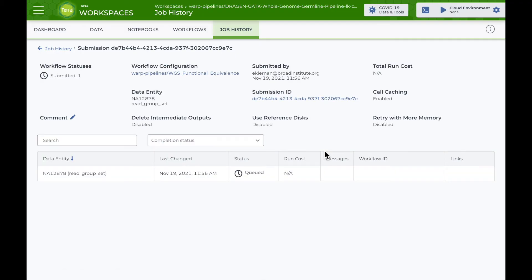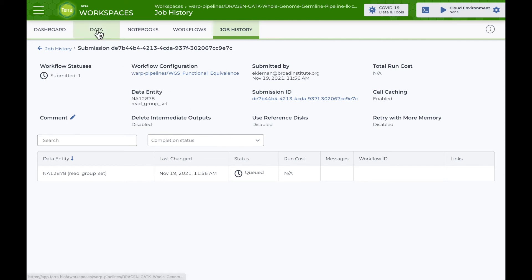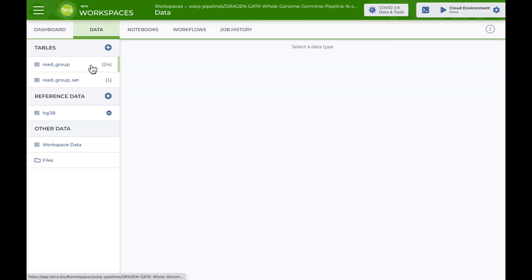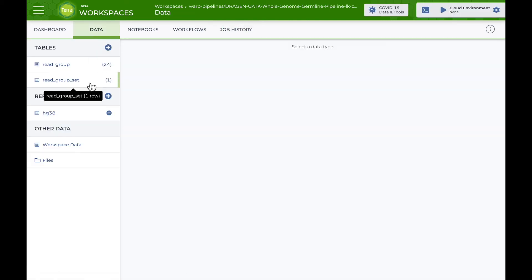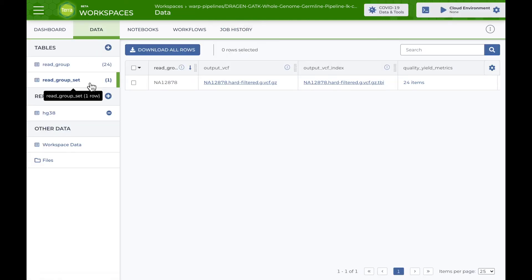I'm taken to the job history page where I can monitor the status of the run. After the workflow completes, the resulting outputs, like the VCF containing initial variant calls, are written back to the read group set table.